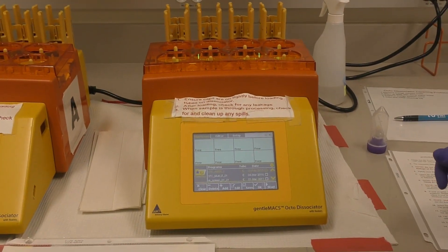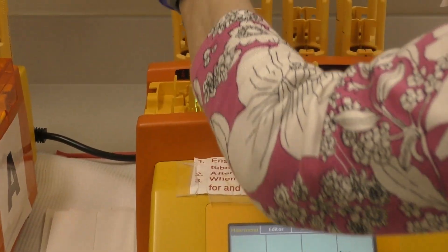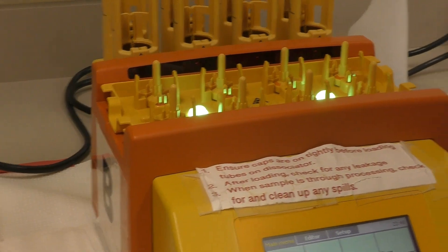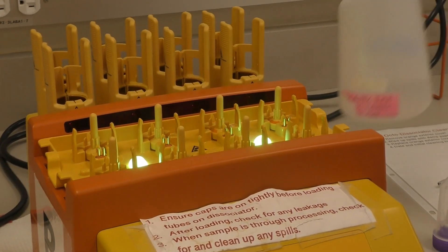Then inspect it for spills. Remove the orange plastic top. Inspect for spills. If there have been any spills, clean with paper towel and ethanol.